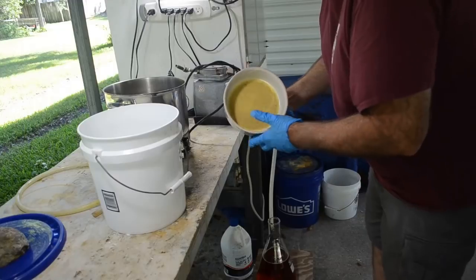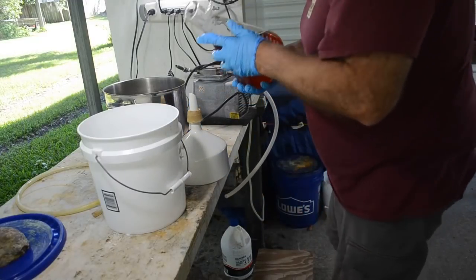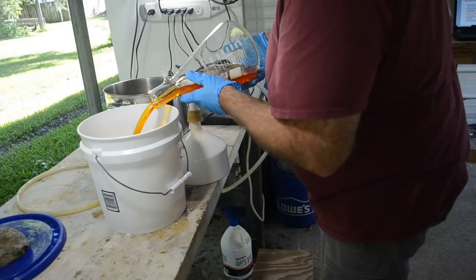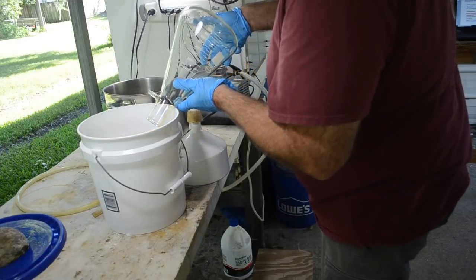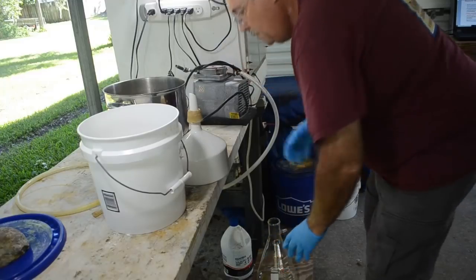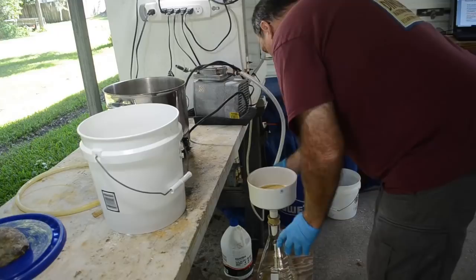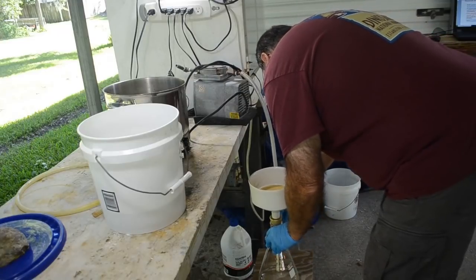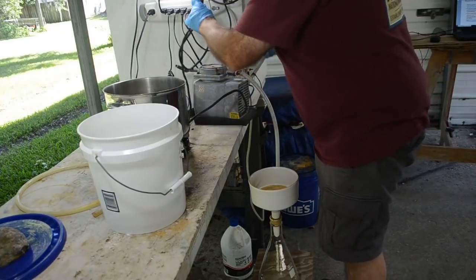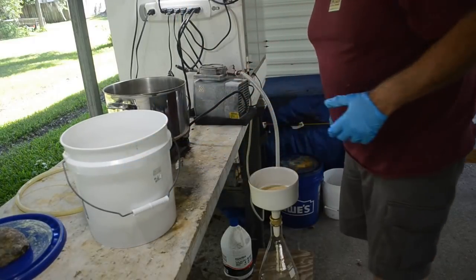I'm not going to lose any of that liquid. Pour this into the white bucket. Filter the rest of it. It's going to take a little while because the filter's a little bit plugged now, but oh well, I've got time. I'll be back when I'm done.